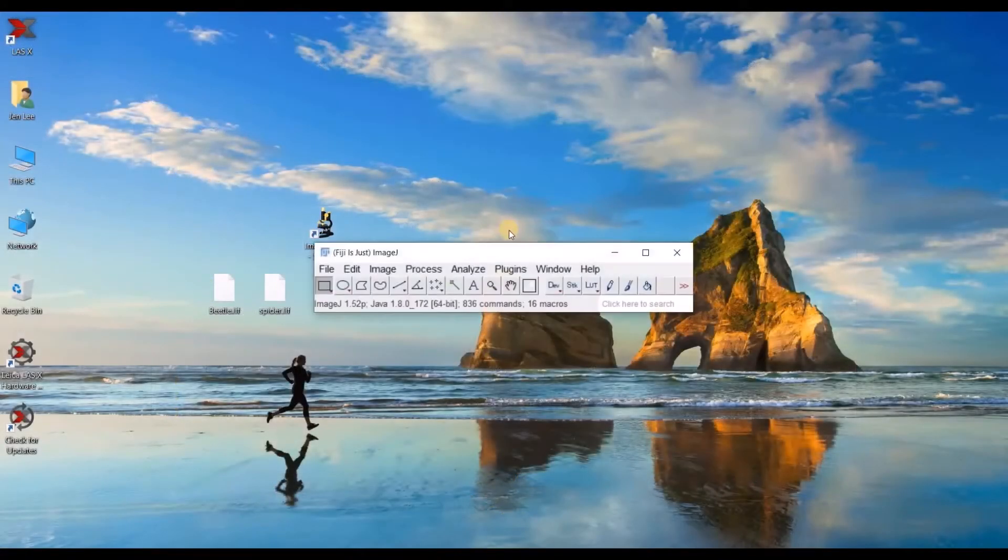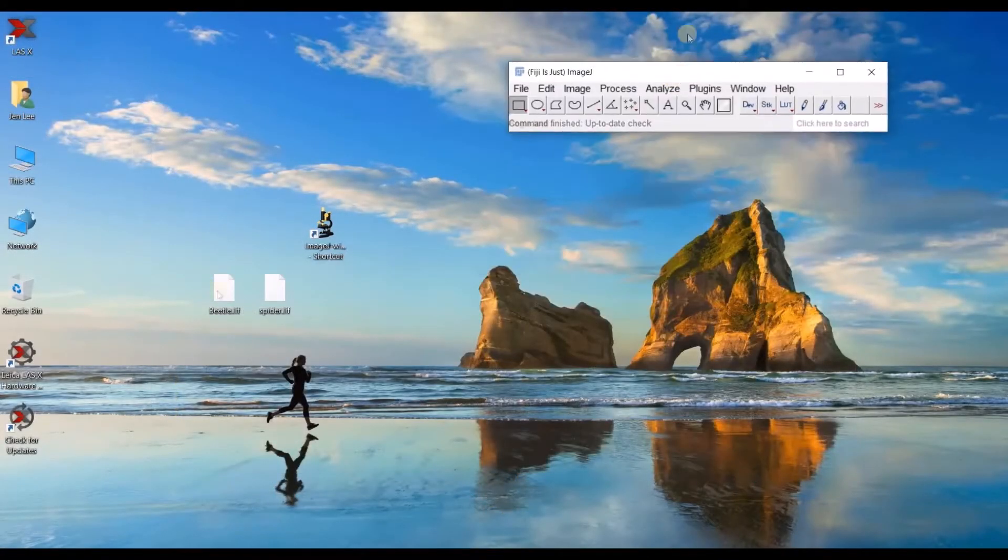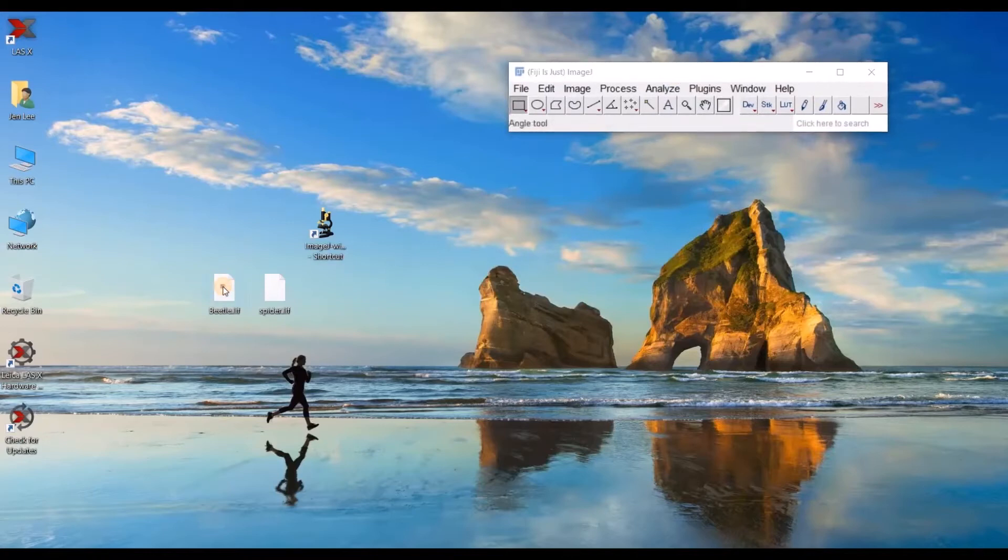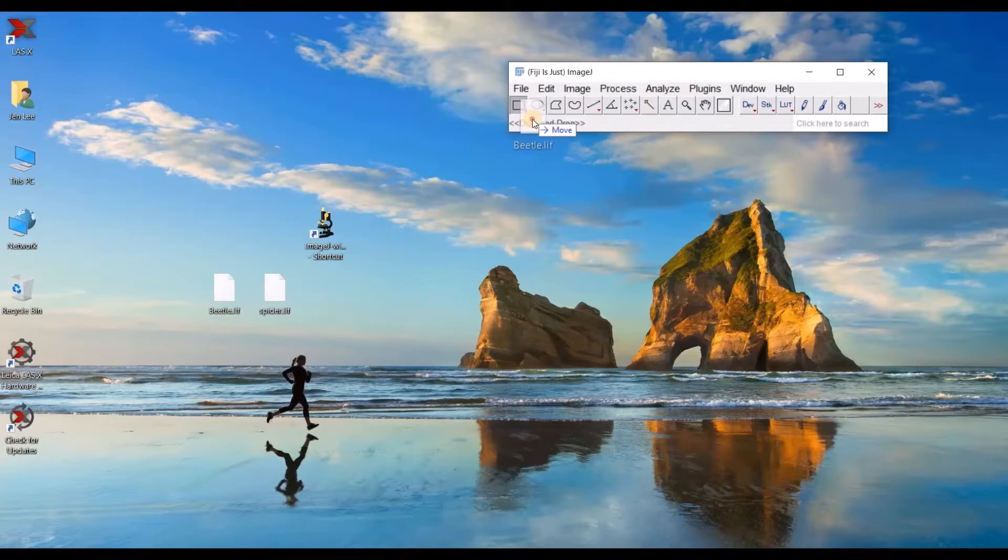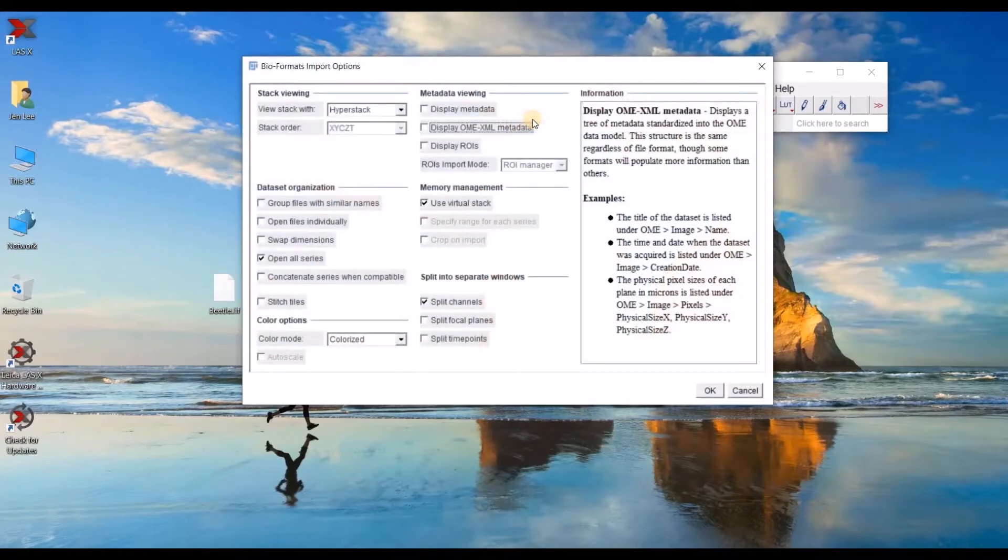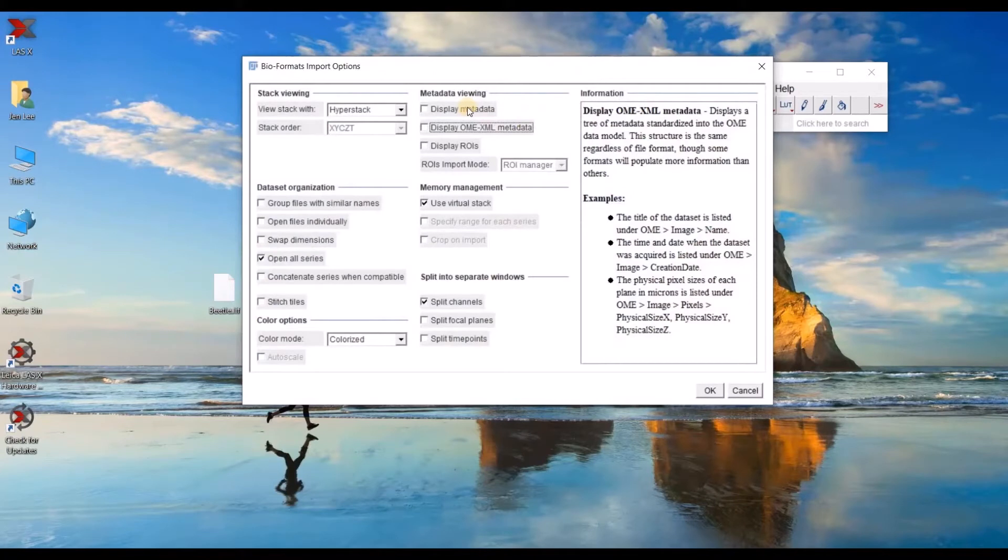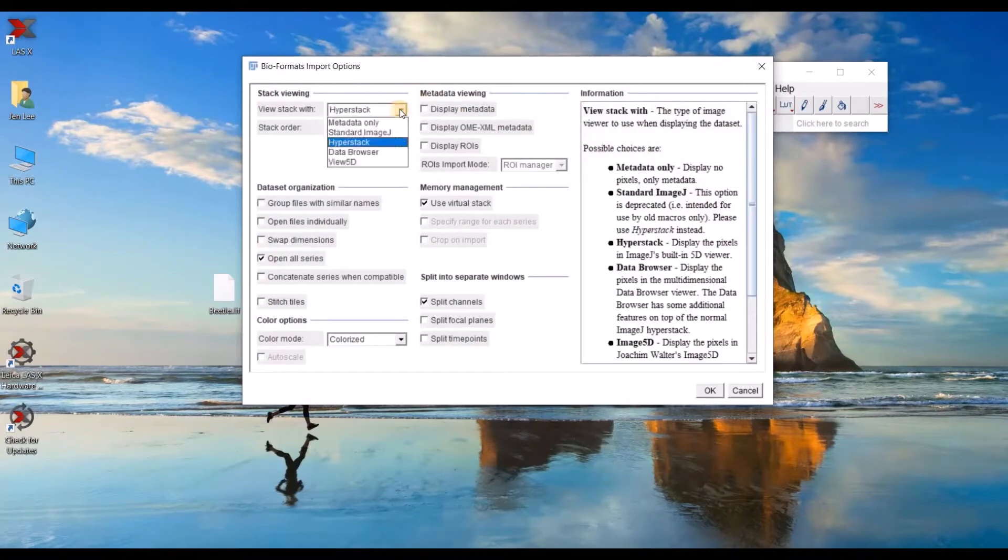Once you open Fiji, you can either drag the file over to this bottom bar or you can go to file then open. When you try to open the LIFF file, this bioformat import options menu comes up.